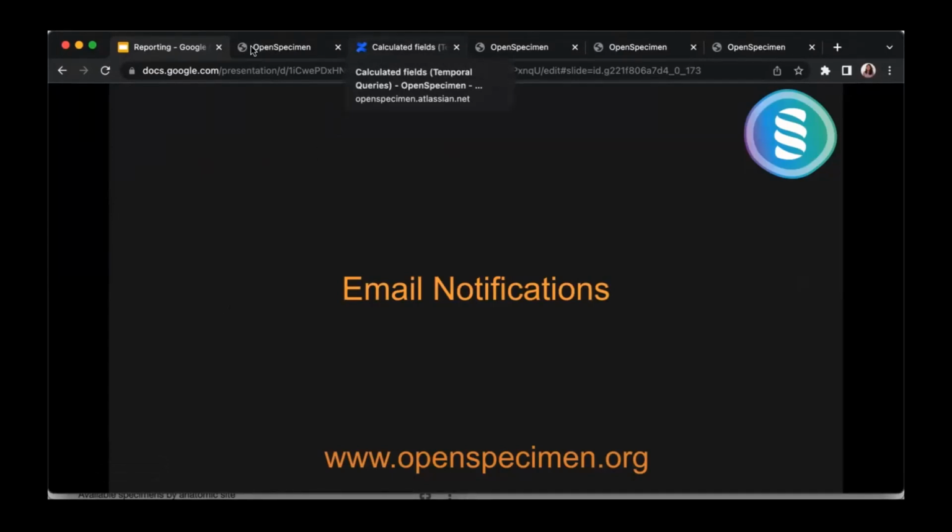Before we do that, is this something that is of use to you? Do you plan to give access to the researchers so that they can request the samples on their own? Yeah, in some cases we will do that. In other cases, they won't be comfortable with making queries, so we'll have to get an overview of what they want and create the queries for them. And I think there's, I forget what it's called, a way to get a catalog without having an OpenSpecimen account, like an outward-facing website?